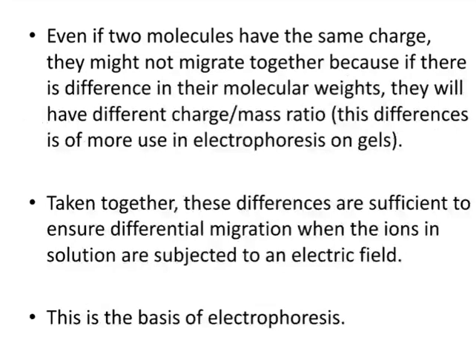For example, if a molecule has less mass and carries a negative charge, then it may move very slowly or very fast under the influence of the electric field. So this is the basis of electrophoresis.